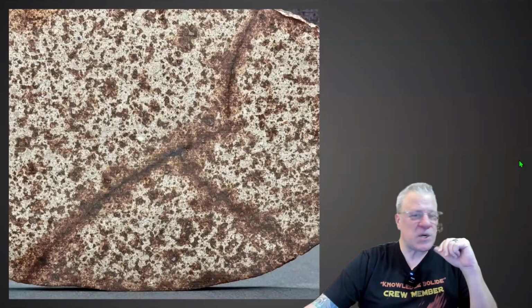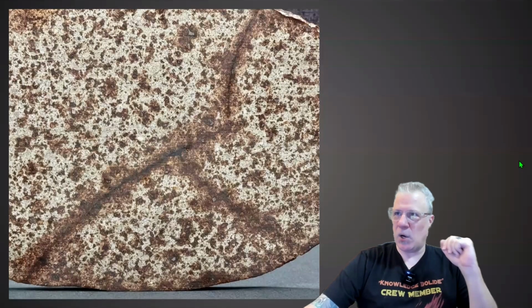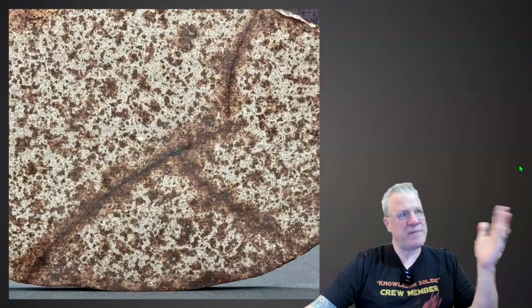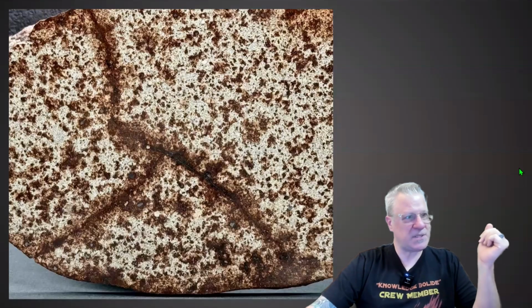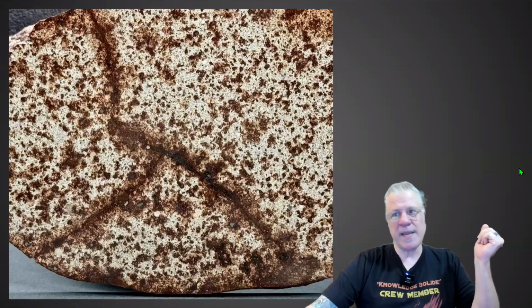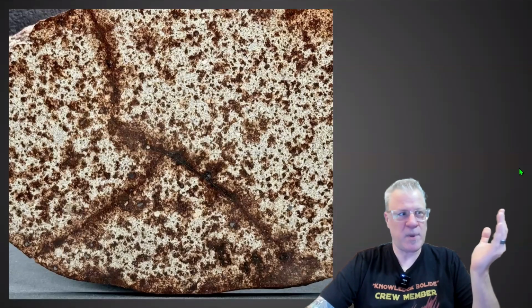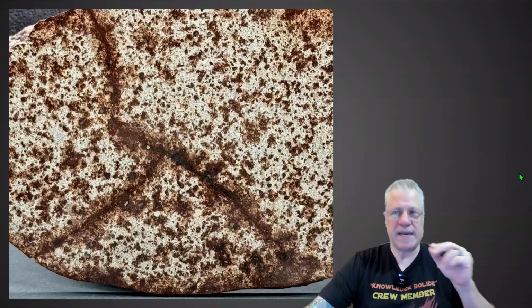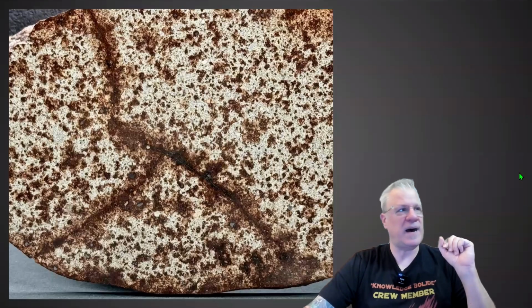Most slices are really homogeneous. They all look pretty similar, so these are very representative, but every single slice is going to have these shock veins going all the way through it. And as we learned last time with Daniel giving us the classification, he hinted at an S5, so a shock level of 5.